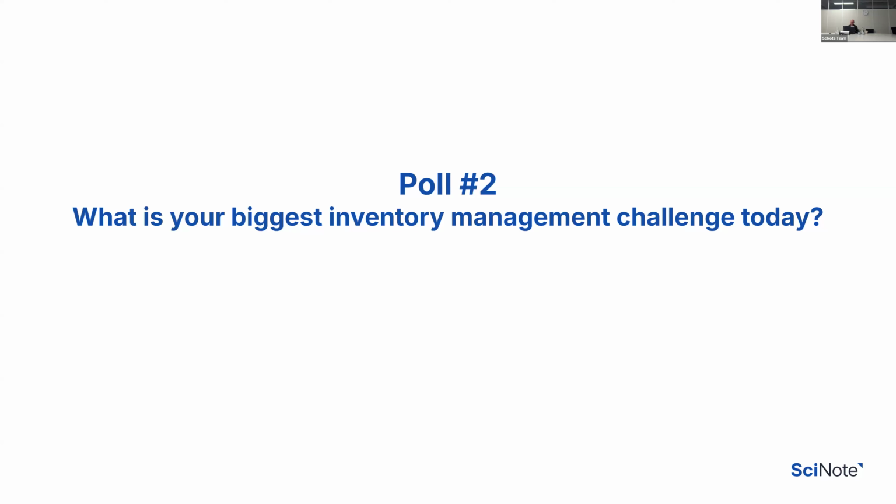Yeah, I agree. This is something we hear about often because it has a lot of downstream issues as well. If you don't know what's been used, how much is left, this is a big issue. What I was expecting, I expected that more of you would say that audit and compliance requirements are also the issue, but only 6% of you did. Okay. Let me stop sharing this and move it away. And I'm going to continue with the next slide.